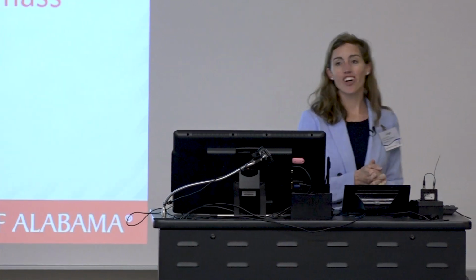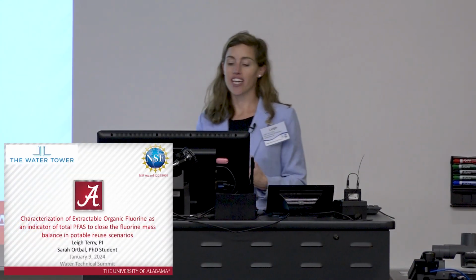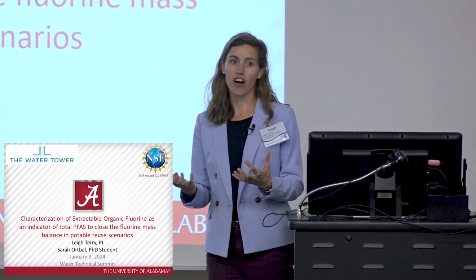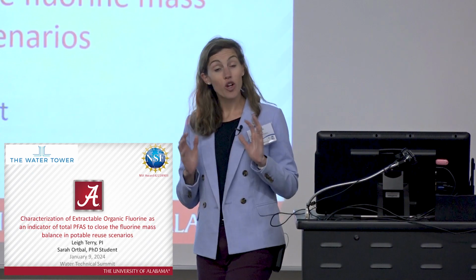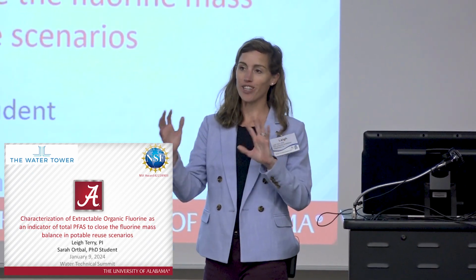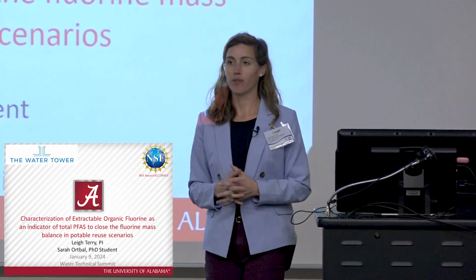So today I'm going to talk about PFAS. We're going to look at characterizing extractable organic fluorine as an indicator for total PFAS in water reuse scenarios. This presentation could really go in the wastewater or the water section. We're reuse, so we're kind of merging the two. So put on your drinking water hat, and then we'll go into your wastewater hat.